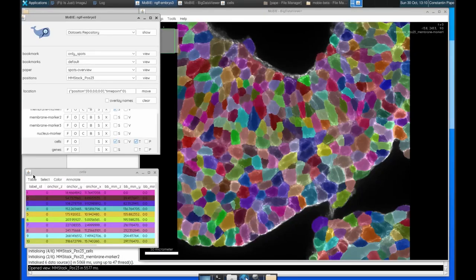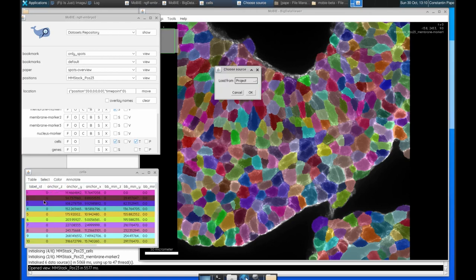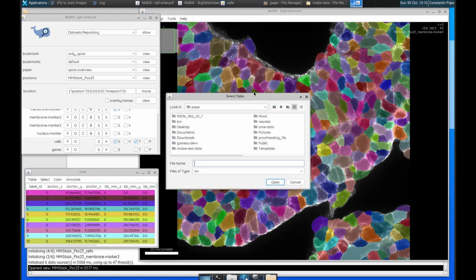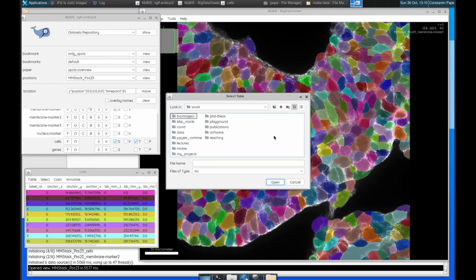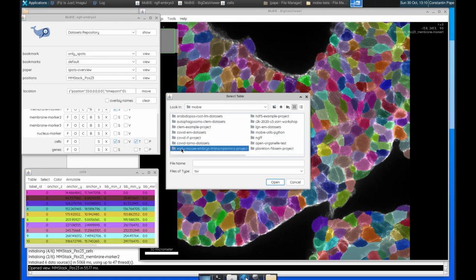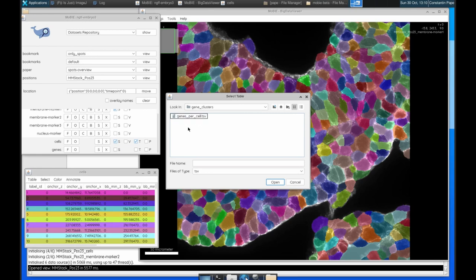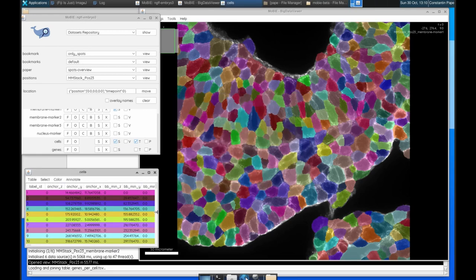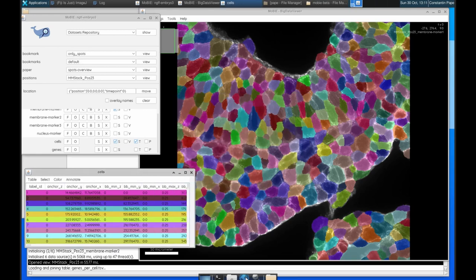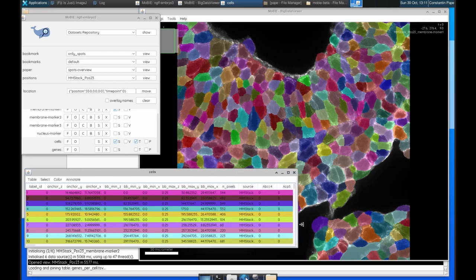So when we get back to Mobi, we can do table, load columns, load from the file system, and we can go and find that table that we just made with Python. So here it is. We click on it. We click open, and it will add all of those columns that we just made to the end of this table. So you can see them there on the right hand side of that table.